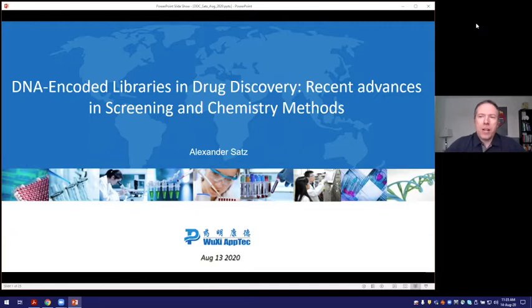And I'm going to touch upon a couple of other different topics. I'll give you a case example of the successful screening of a target to find a drug-like hit. And I'll also talk about a couple of limitations that DEL screening currently has, and how we in the field are attempting to tackle those problems.